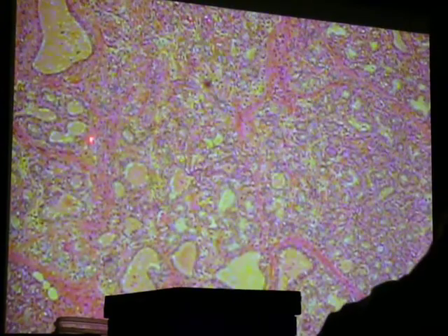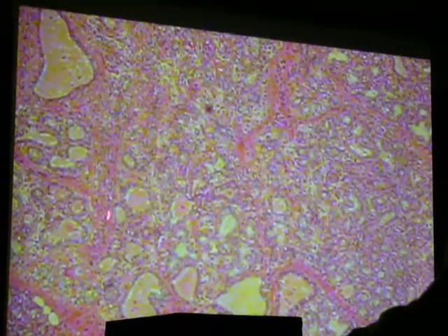It's going to be lactating because mostly all I see is glands. That bright pink on there is the interlobular connective tissue. So that's all the connective tissue here, dividing it up into lobules.